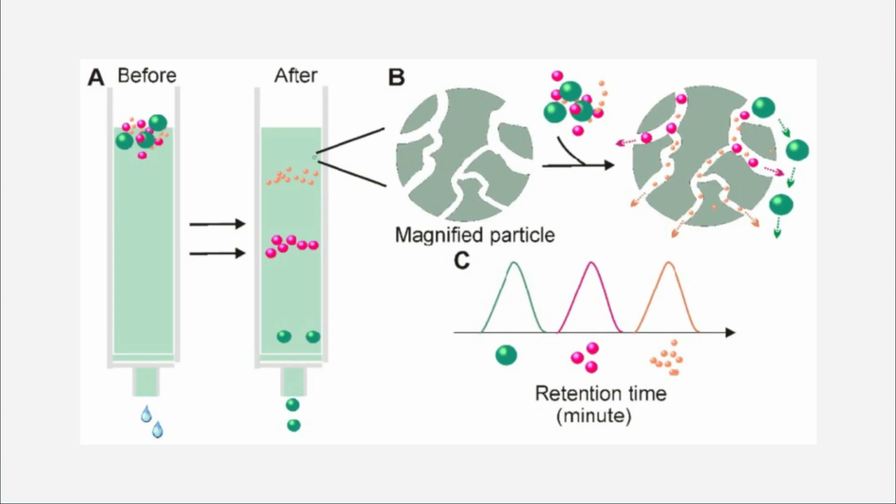Whereas here, the separation is based on the size of the molecules or particles. Once you add the sample, it starts separating.